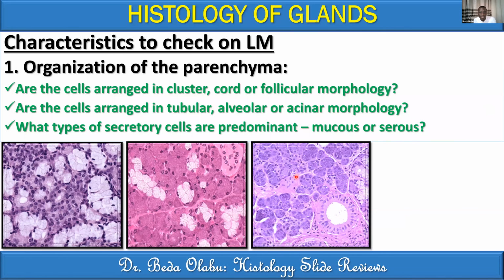You may notice something else there. I want you to identify this structure here. Again, just put it on the chart, I'll see.